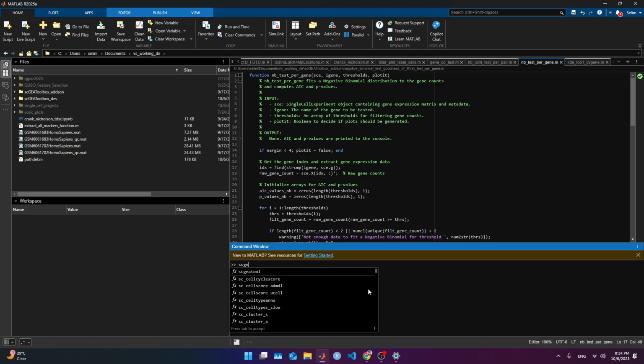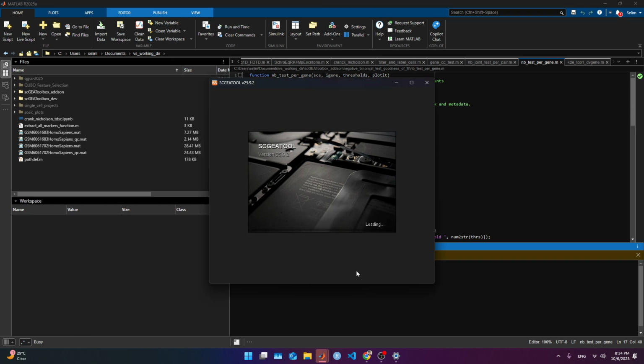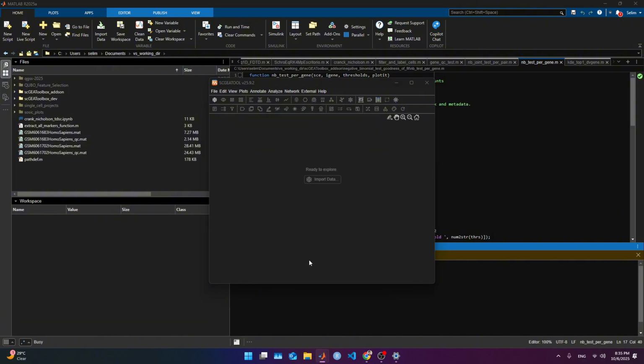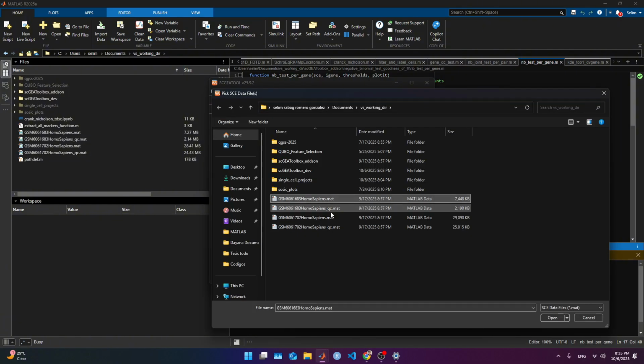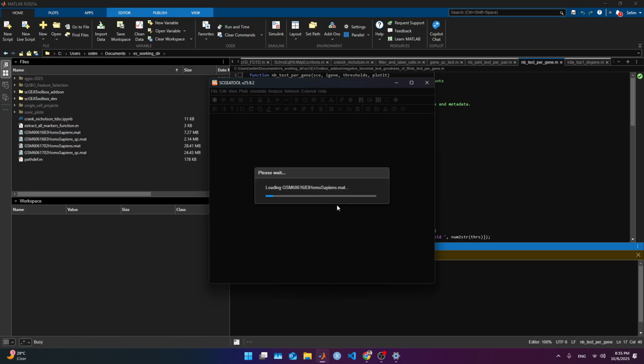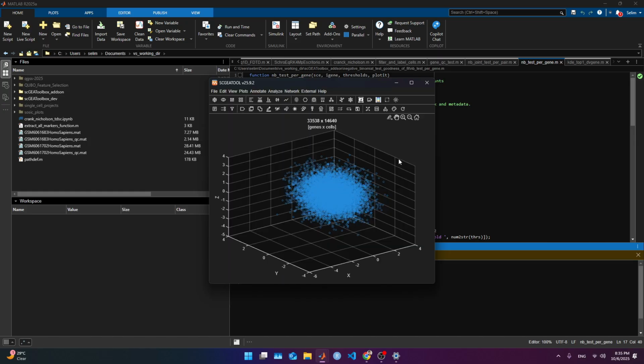We're going to do the scGEAToolbox and grab the non-QC files we have from the Becker data. So what we're going to have is to open the SEEs, the raw data, and here I want to cover something I didn't do before. I'm going to do union here. Might take a few seconds. All right, we get this.